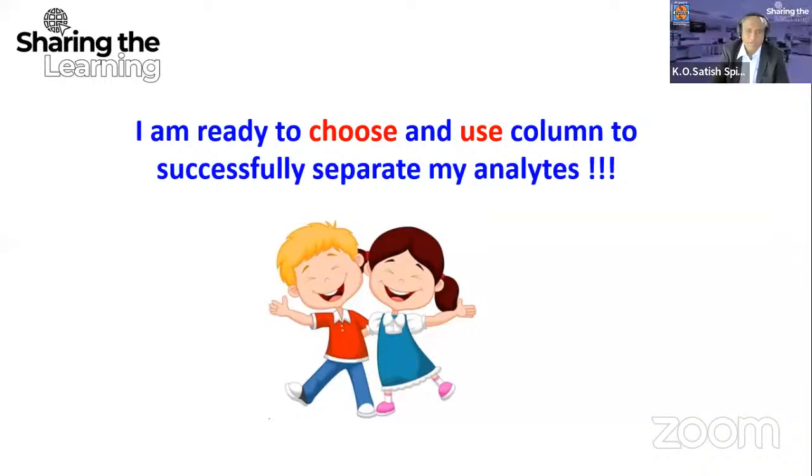Thank you. So another question from Mr. Mangeshwar. Which column should we use for the analysis of oil compounds? Fatty acid columns. I think there's not much specific about the compounds that you wanted to do. It's just mentioned analysis of oil compounds. If it is a castor oil, for example, we use what is called FFAP column. It is called free fatty acid columns, FFAP column. So normally we do not do it by HPLC, but we do by gas chromatography, high temperature gas chromatography.